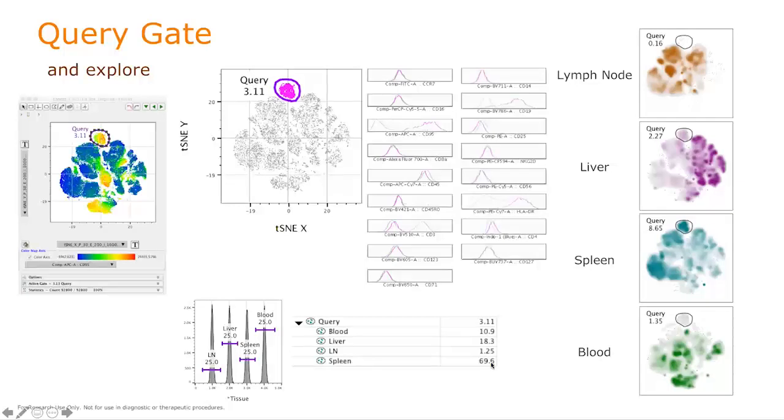Well, that's a huge difference than having 25% across the board. If everything were 25%, I would say, well, this population, whatever its phenotype is, isn't changing across my conditions. In this case, I can say, oh, this phenotype, which are CD95 positive B cells, is actually expressed at high levels in the spleen and virtually absent from the lymph node, right? And make that observation and that conclusion.